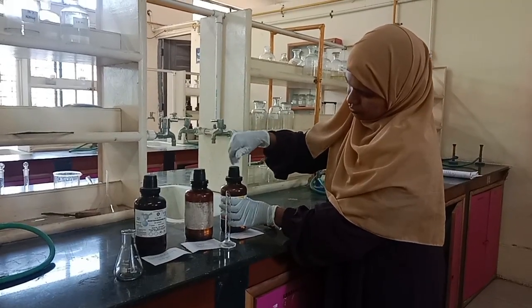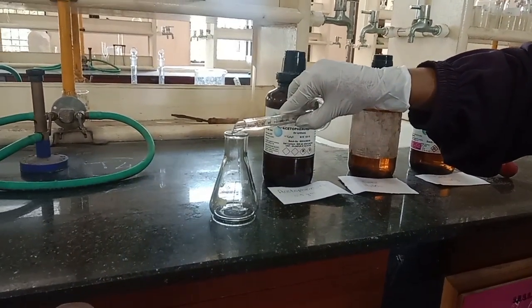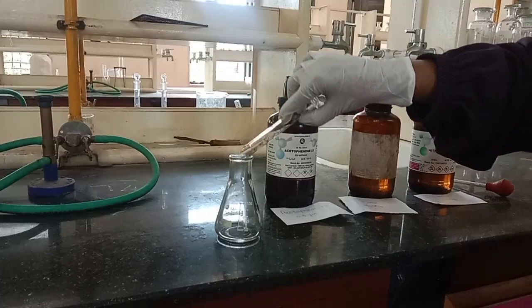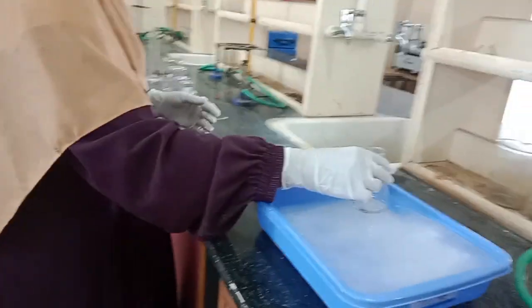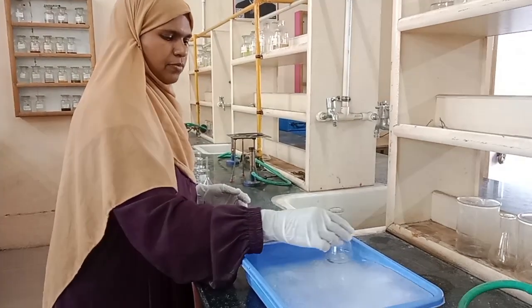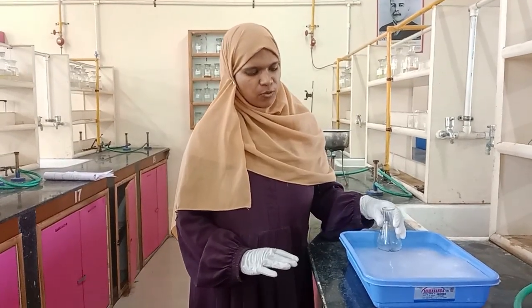Here you can slowly add, because the solution can bump and harm your face or body parts. Cool it to 0 to 5 degrees centigrade. Now our nitrating mixture is cooled down.